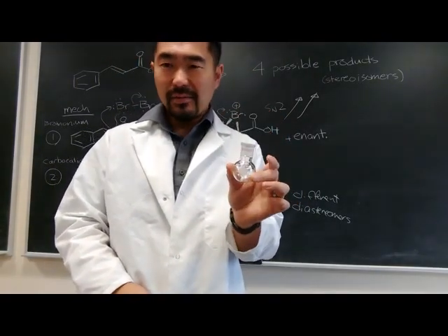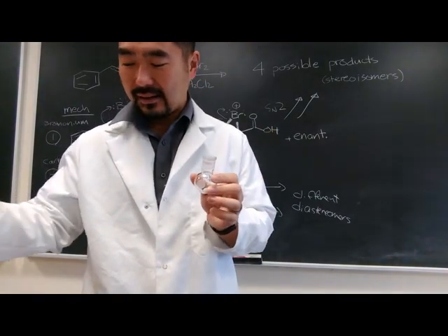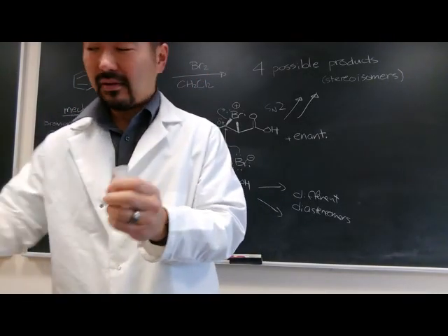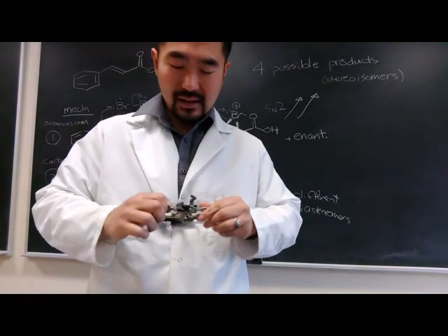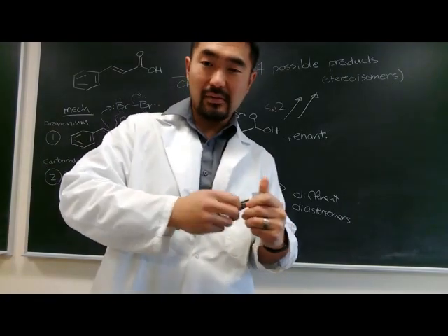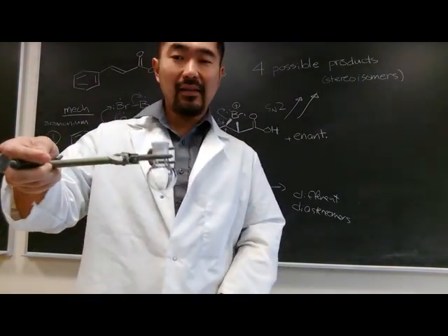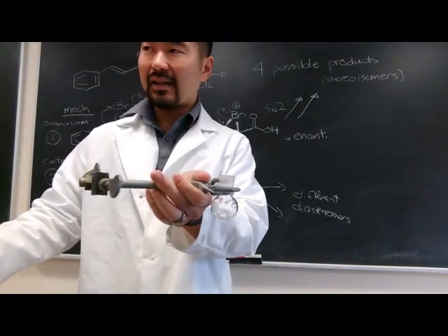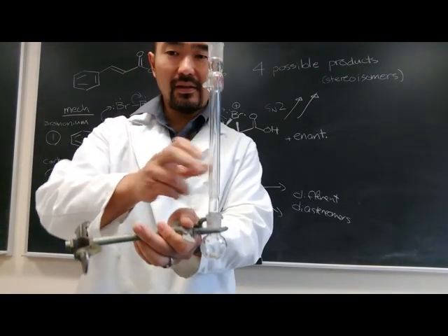And then you want to add 1.7 milliliters of bromine solution into this round bottom flask. Now, after that you want to clamp this onto your monkey bars in your fume hood, and you will want to use one of these clamps, and always clamp at the neck of the glassware. Of course this is attached to the lattice structure in your fume hood, and then you can place your condenser.